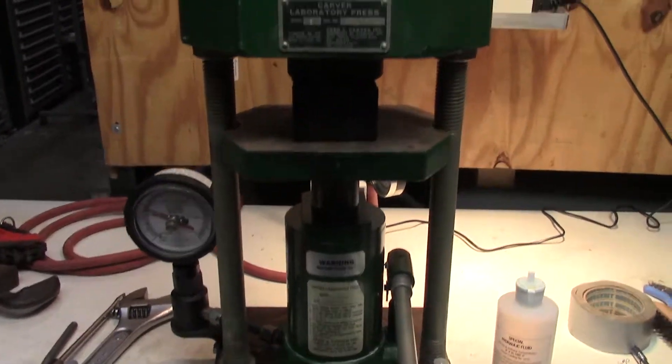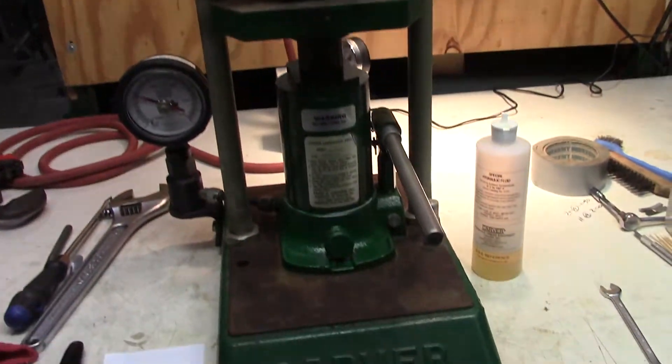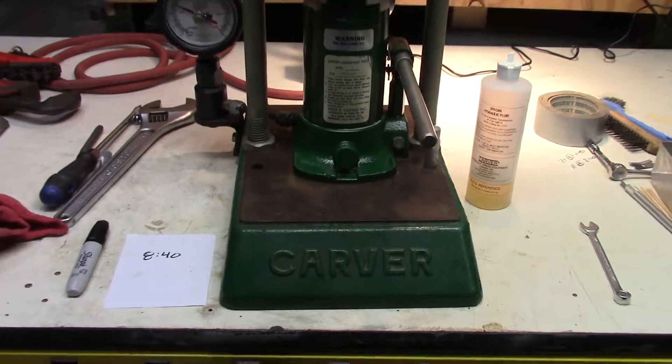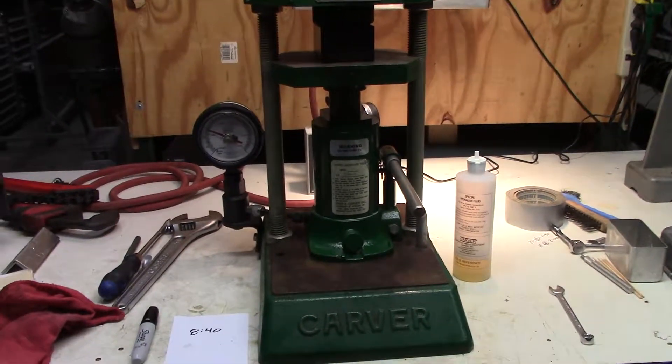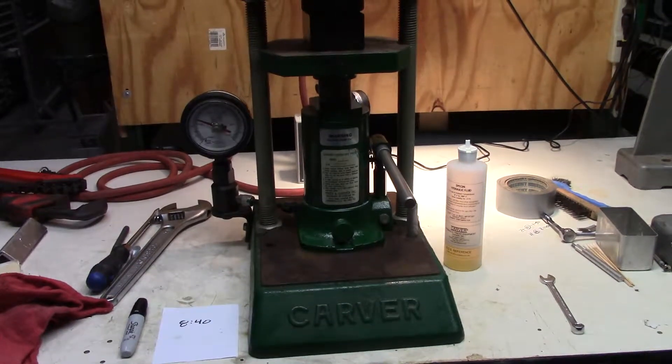I'm going to leave it this way until it gets picked up. I just wanted to give you an update on your repair. If you have any questions, you can give us a call at 609-518-9100 or you can reach us at HitechTrader.com. Thank you.